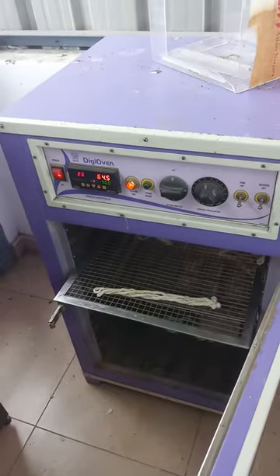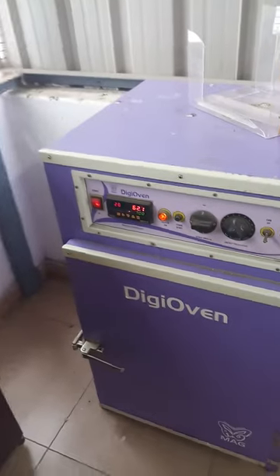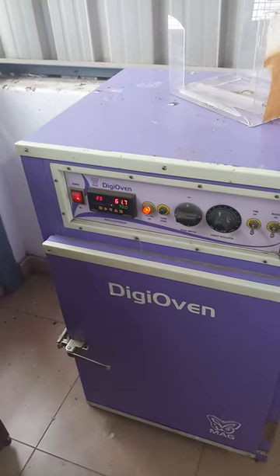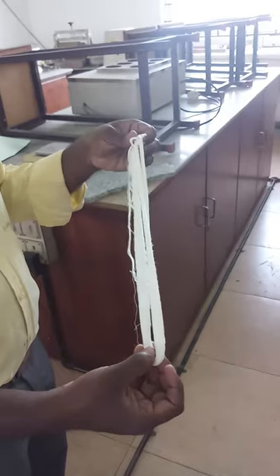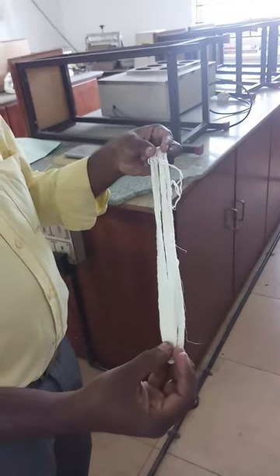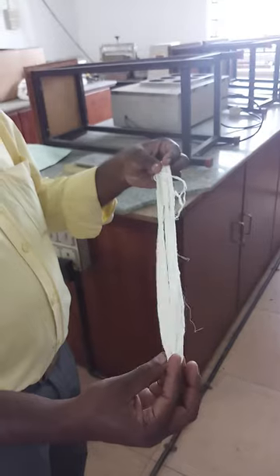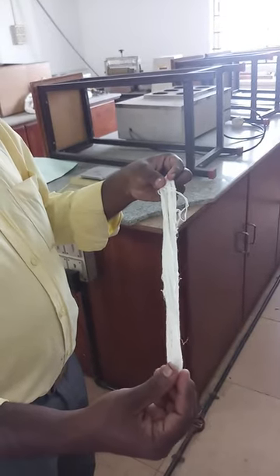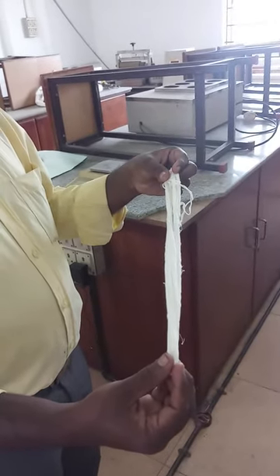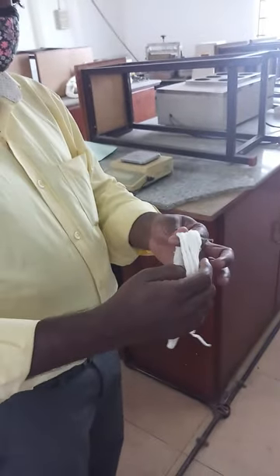After bleaching the sample, it should be subjected to drying in the hot air oven. This is the sample after bleaching. In bleaching, what we have done is we have taken sodium hypochlorite for bleaching. Here the natural yellowish color of the cotton — the cellulose of the cotton material — has been removed and it has become a white material.